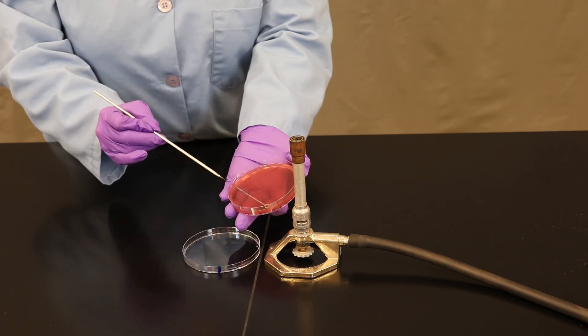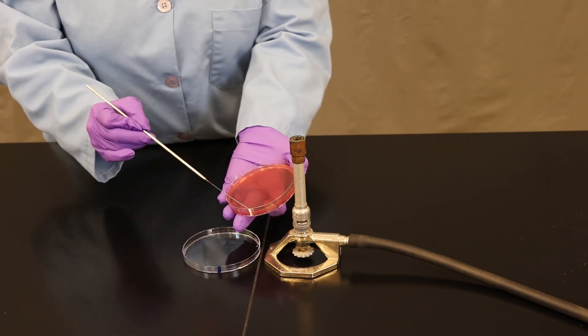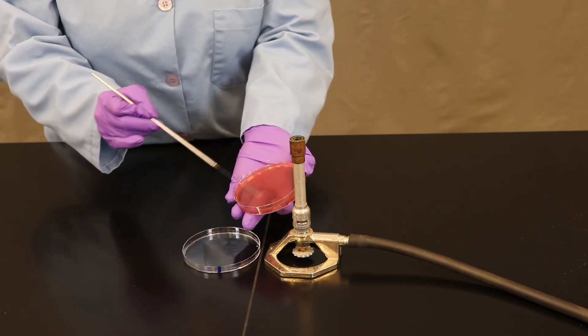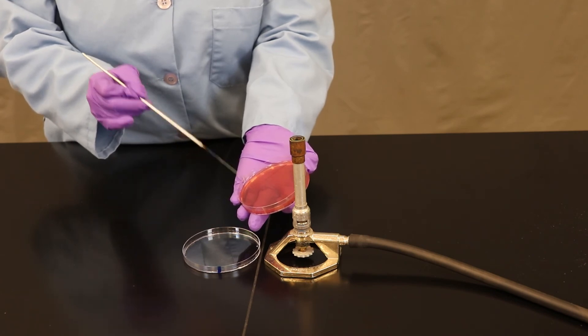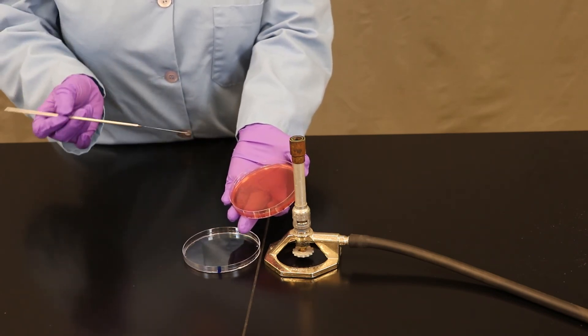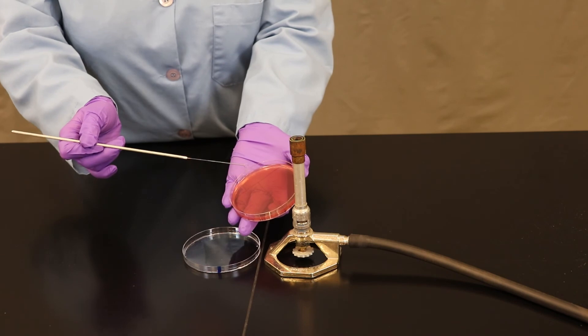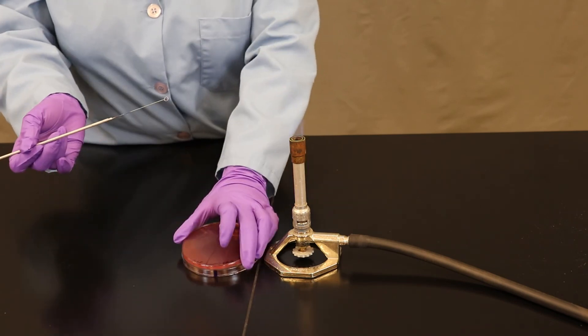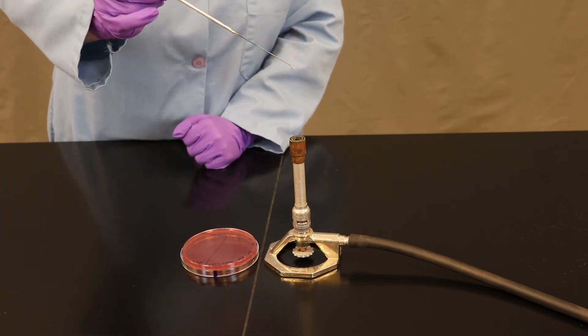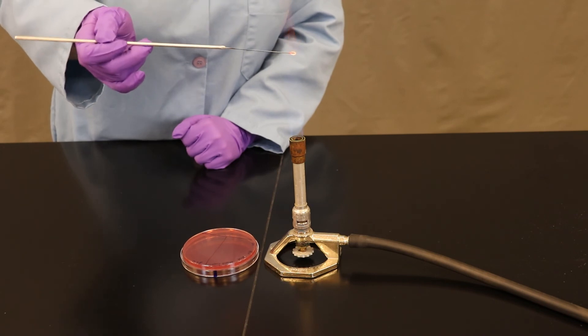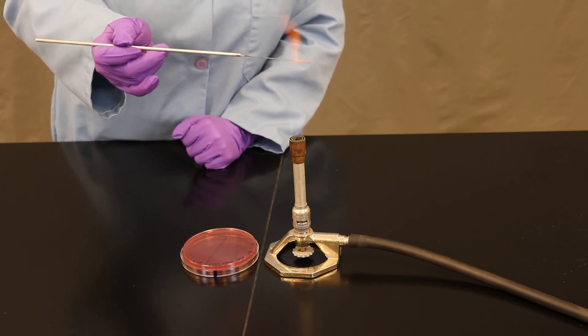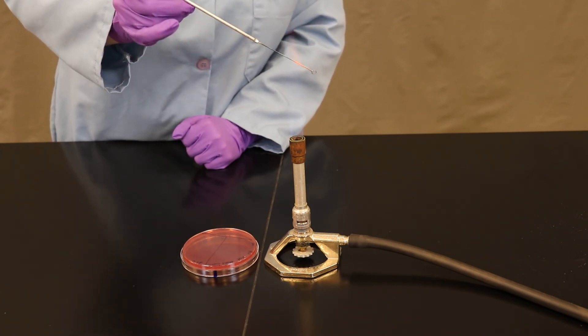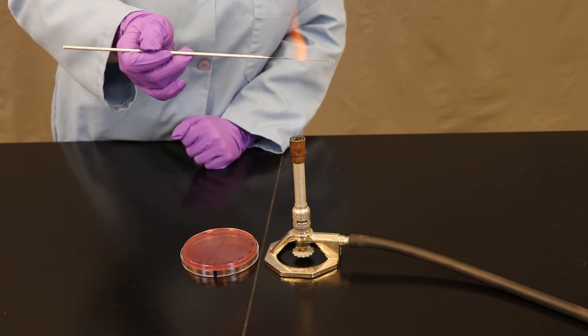Grab into zone two, maybe two or three times, and then again streak back and forth, taking up all of your surface area. Make sure you're not dipping back into zone one. Be sure to sterilize your loop one final time before putting it away into your kit. And that's how we perform a standard streak plate.